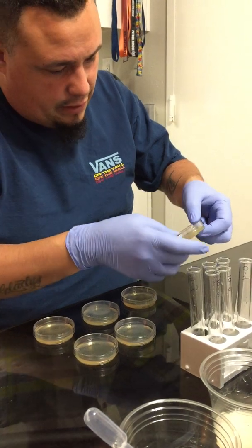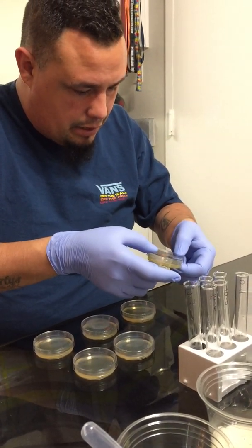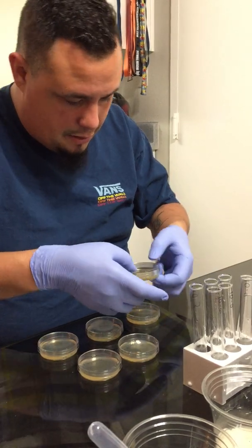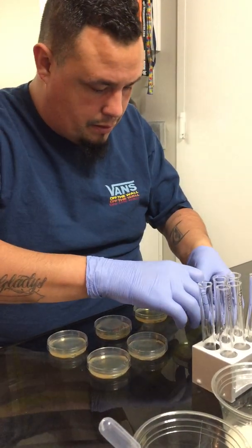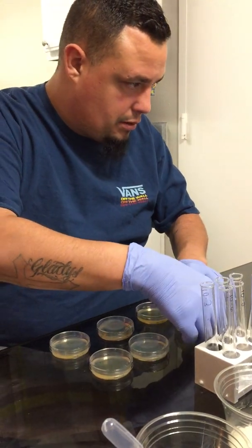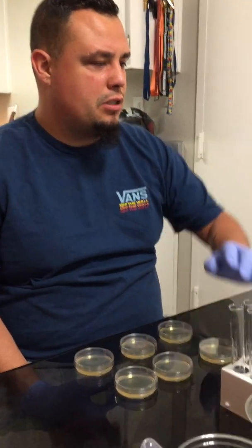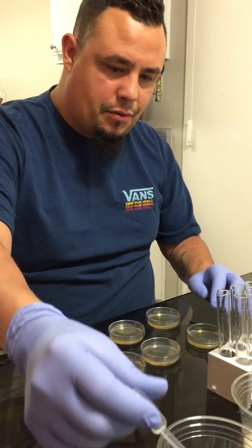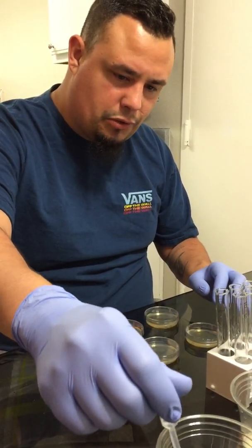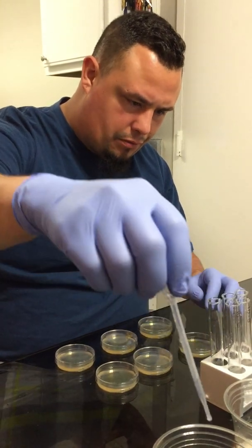Now that it's all evenly dispersed all over the agar, we'll let it sit. So basically we just swirled the plate gently to spread the solution evenly over the surface of the agar. So we did that with number 1 and tube 1. So we're going to go ahead and move on to number 2.